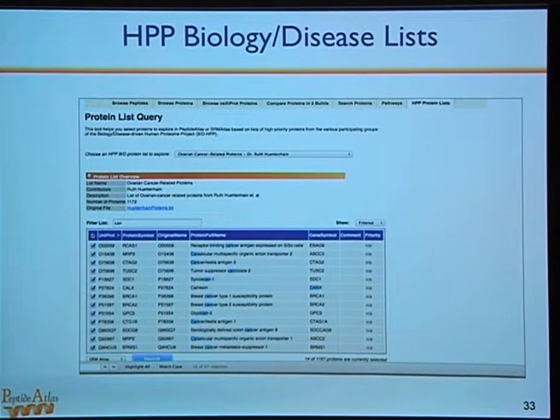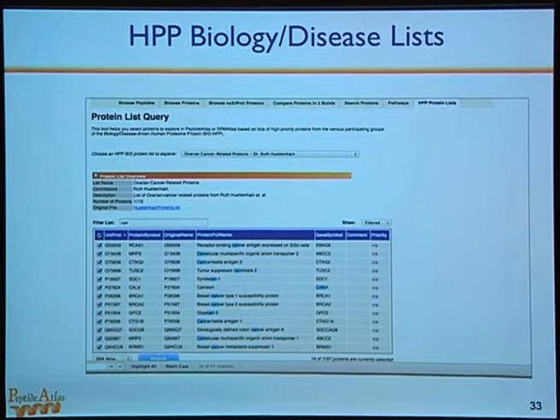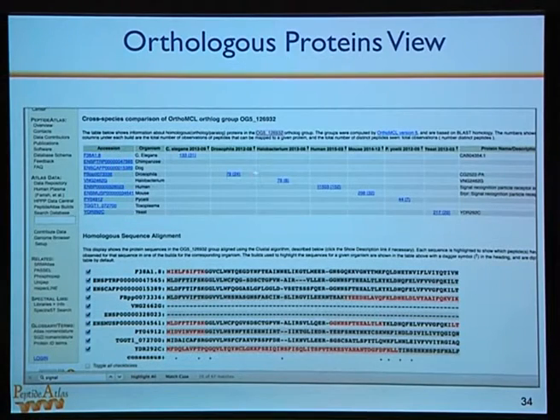So if you have some proteins or protein family you're interested in, you can type in the name, select them, then erase the text and type in something else, and this is a pretty powerful interface for building subsets of these lists that are interesting to you. Again, this is an example of how we've integrated with information that's in the community, and we try to make an affordance so that you can use this to interrogate the PeptideAtlas.